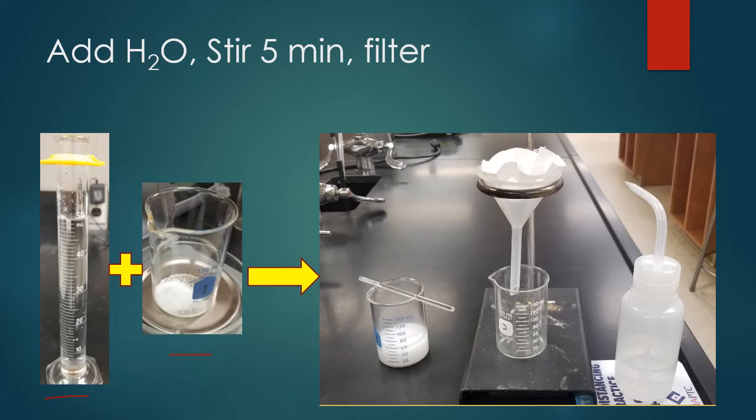So the sodium chloride will dissolve, the sand, however, will not. It will remain in the solid state. Once we have stirred it for 5 minutes, we will then let the mixture sit and settle. We're trying to let the sand, the solid, the silicon dioxide, settle to the bottom so that we can do our gravity filtration.